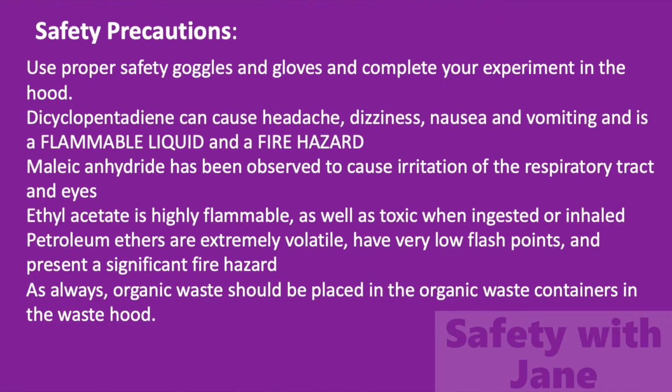Use proper safety goggles and gloves and complete your experiment in the hood. Dicyclopentadiene can cause headache, dizziness, nausea, and vomiting, and is a flammable liquid and a fire hazard. Maleic anhydride has been observed to cause irritation of the respiratory tract and eyes. Ethyl acetate is highly flammable as well as toxic when ingested or inhaled. Petroleum ethers are extremely volatile, have very low flash points, and present a significant fire hazard. As always, organic waste should be placed in the organic waste containers in the waste hood. Remember, always be safe in the lab.